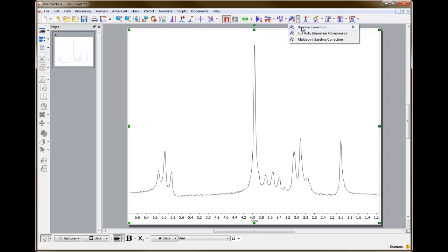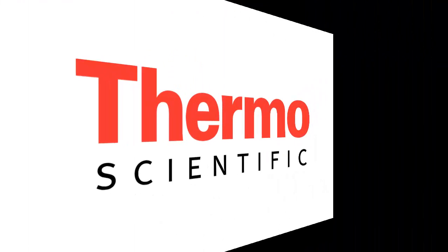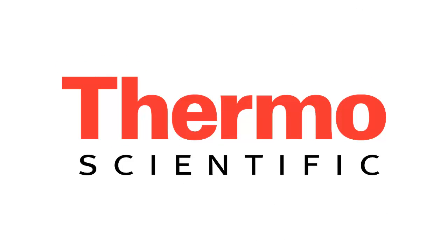Baseline correction in Mnova is very robust, and choosing full auto produces nice results. So if the automatic mode is already set, then just click the baseline correction icon. Otherwise, click the scroll-down menu and select full auto. You should be aware that signal integration is strongly dependent on baseline correction, so venturing into manual, multi-point baseline correction can produce spurious results. In part 4, we'll chemical shift reference our data.